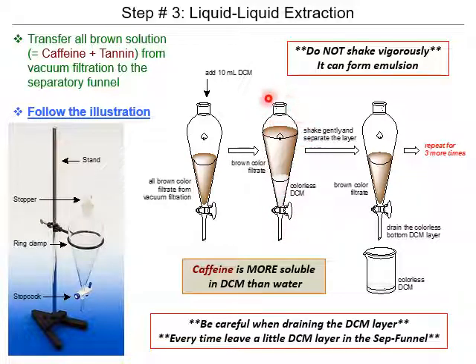But you also want to cover this side, of course, because the layers are going to be pushed that way. So that's why you add a stopper here, right? And you put your hand on top of it to make sure that it doesn't come out.